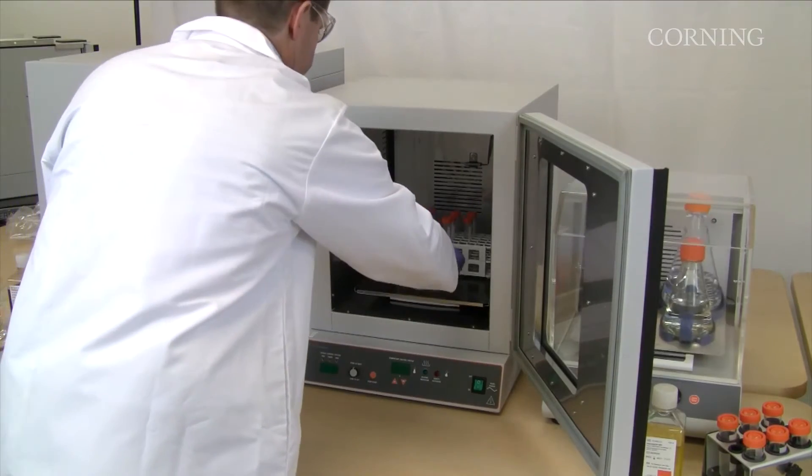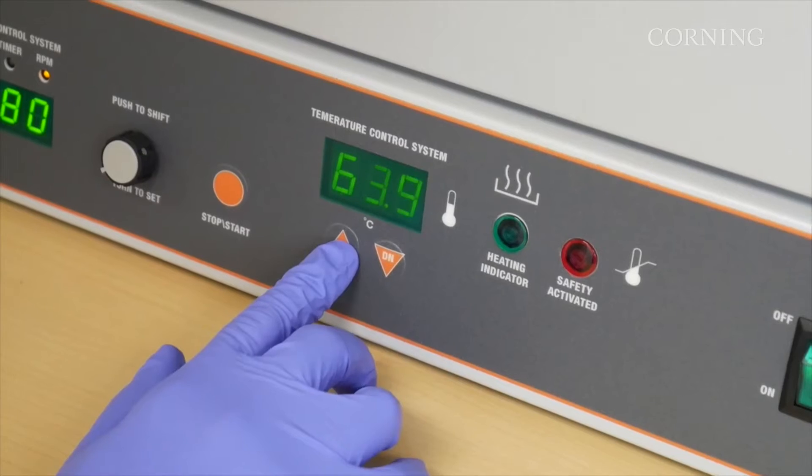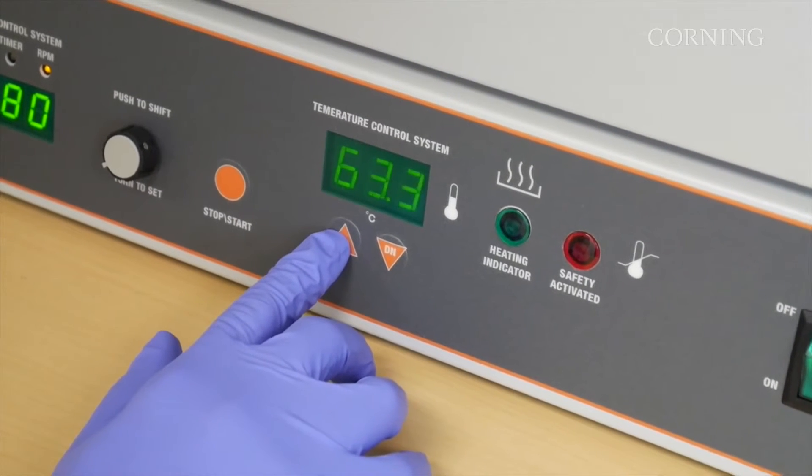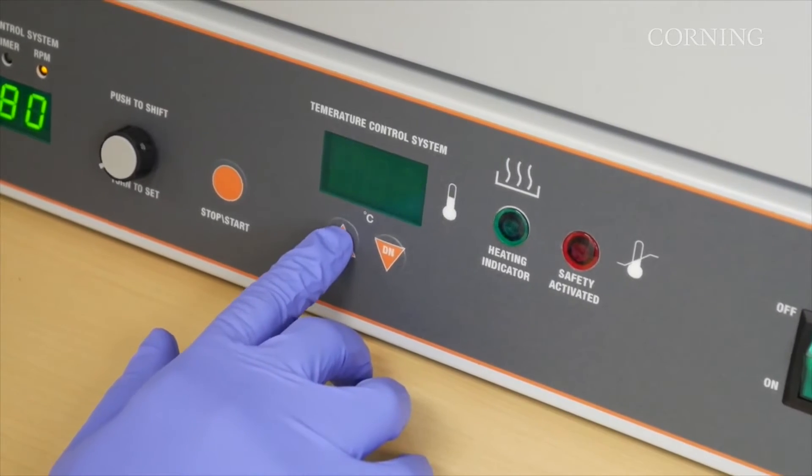the Shaking Incubators from Corning are a safe and convenient way to incubate your precious samples. The incubators have a broad temperature range, from ambient plus 5 degrees Celsius to 80 degrees Celsius.